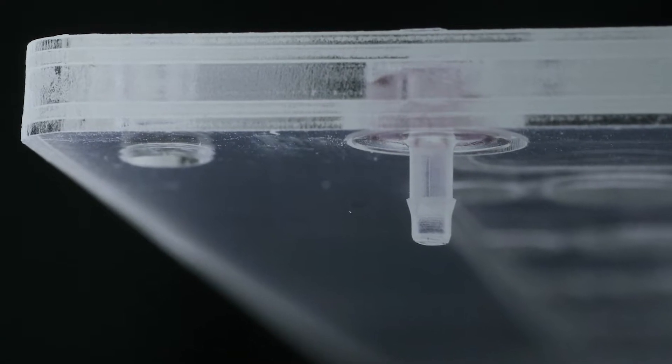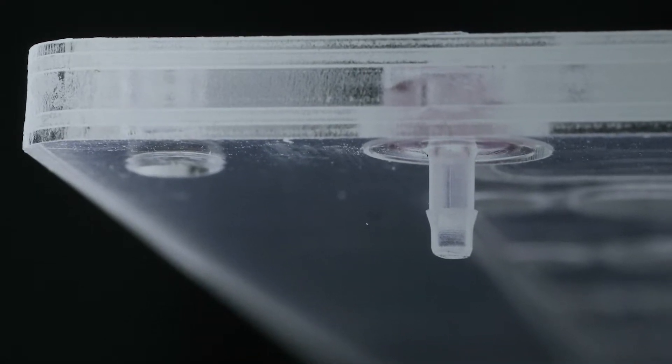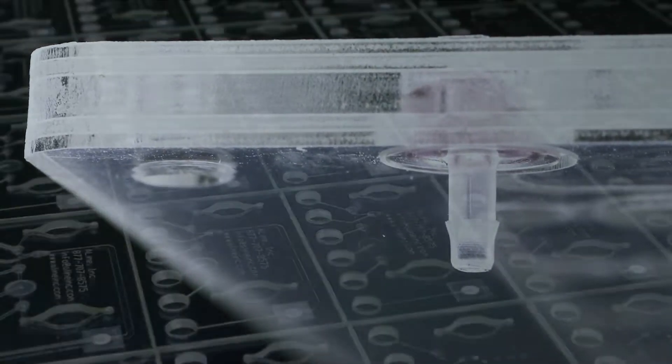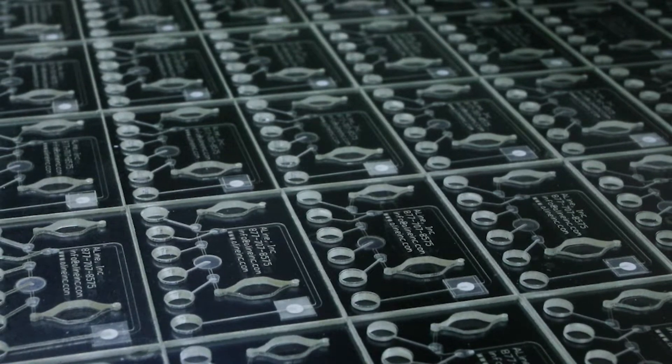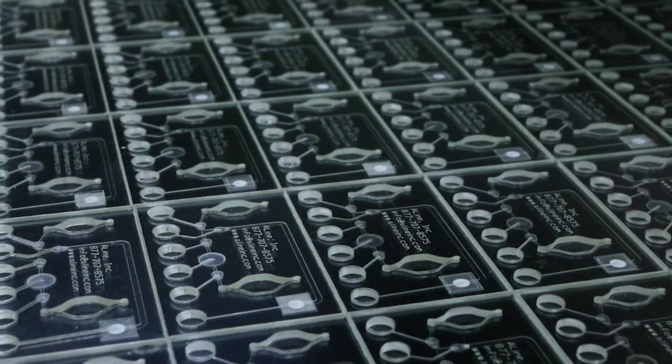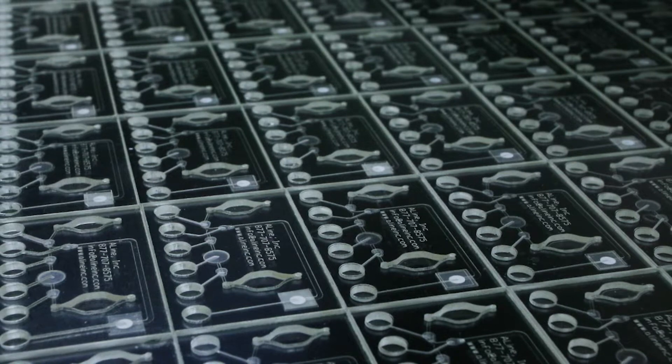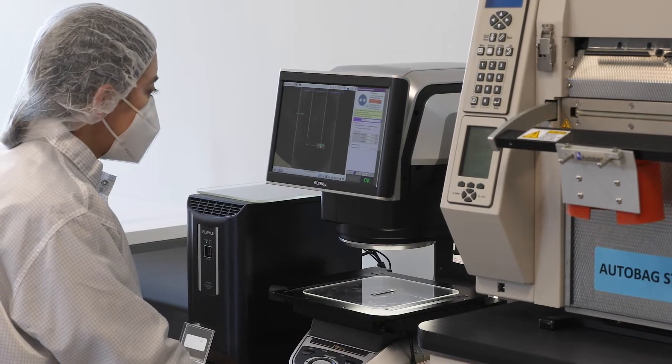In terms of size of the features, our manufacturing process standards are as low as 250 microns. This includes features such as channels and vias. However, we have successfully done 125 micron channels. One thing to keep in mind is that the smaller features tend to lead to a more difficult and expensive scale-up.